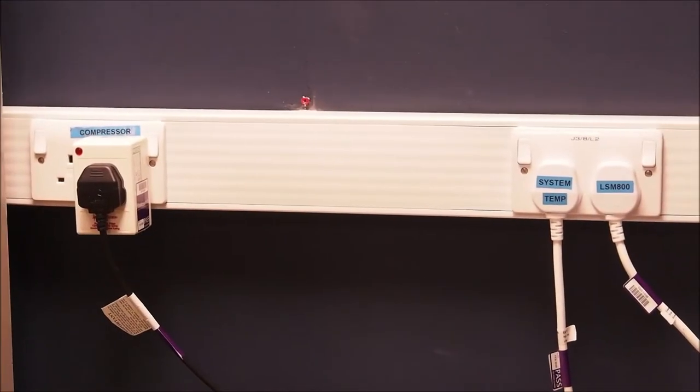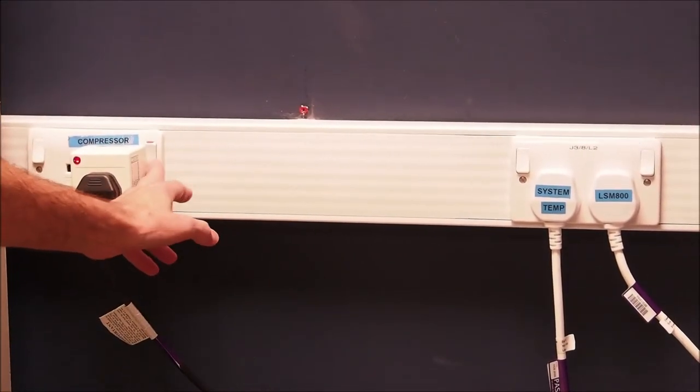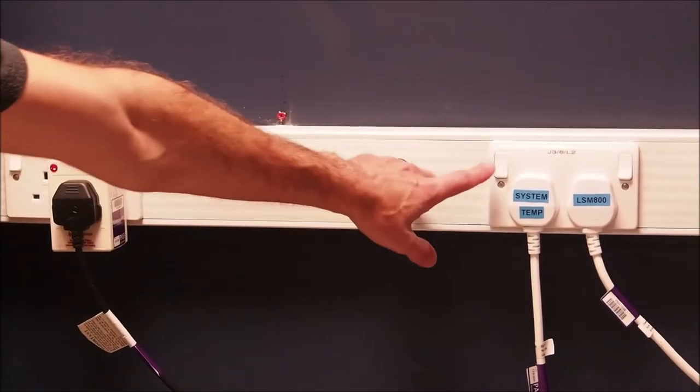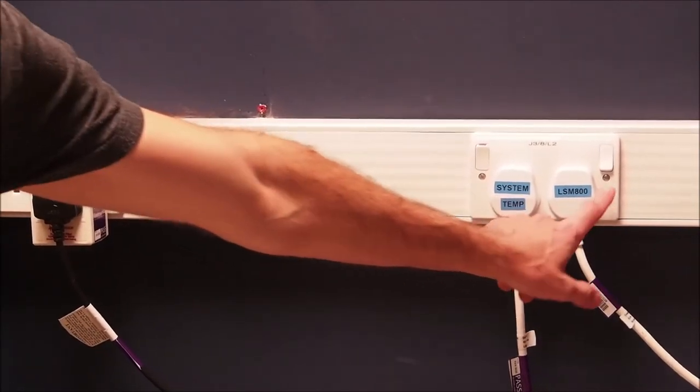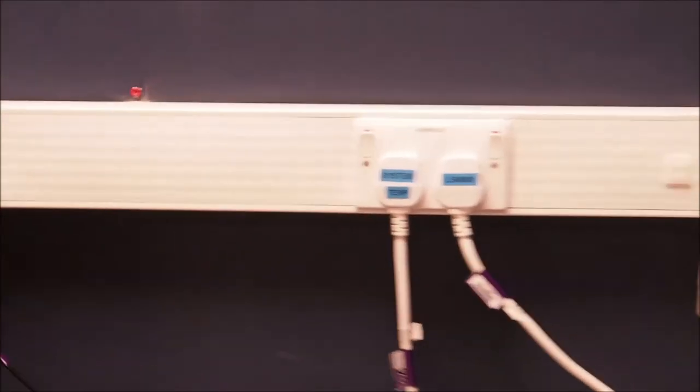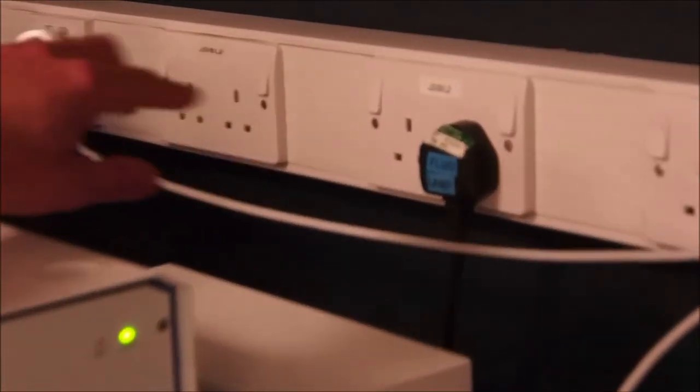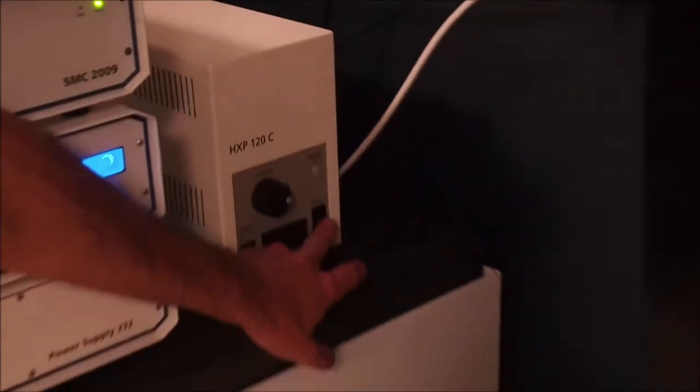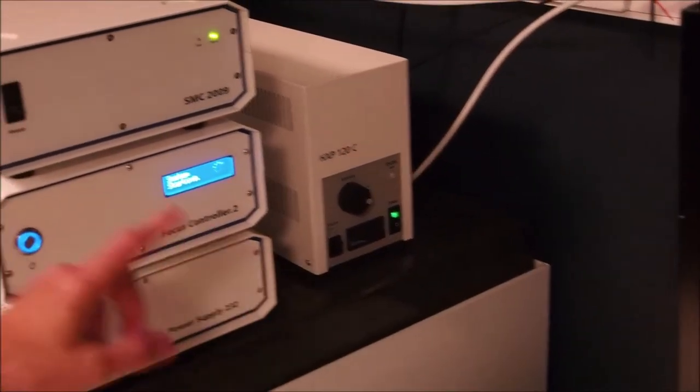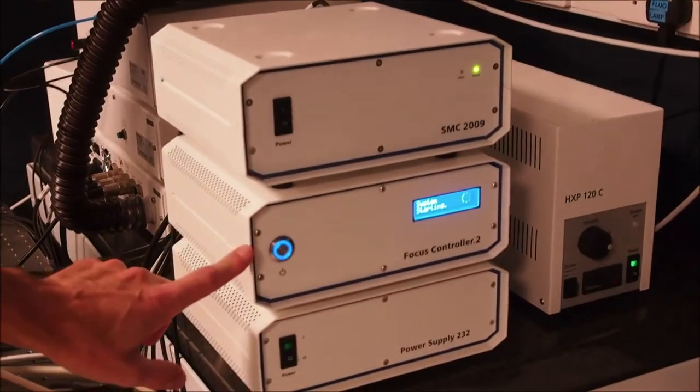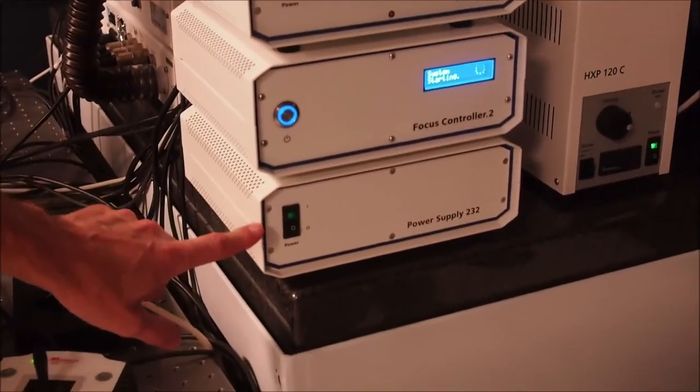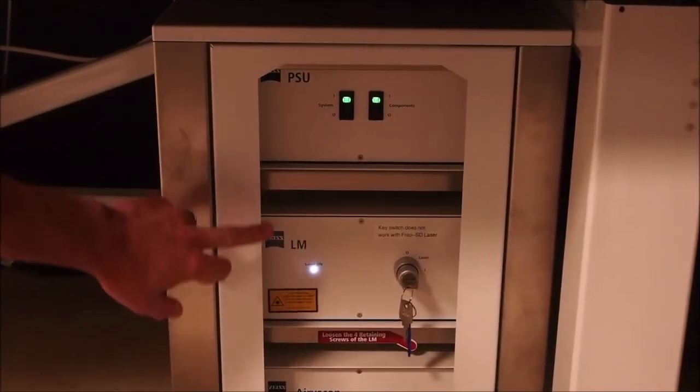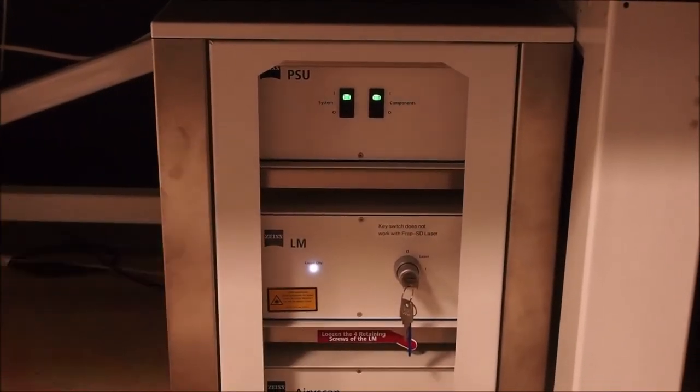First, switch on the three wall plugs to the left of the microscope labeled compressor, system, and LSM 800. Whilst the microscope boots up, switch on the wall plug to the right labeled fluo lamp, then switch on the HXP fluorescent lamp beneath it. Ensure that the adjacent three power supply boxes are all powered on, and beneath the microscope, ensure the PSU power switches are on and that the LM laser key switch is turned to on.